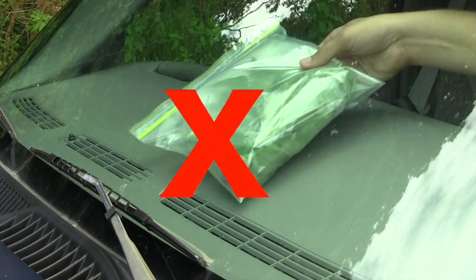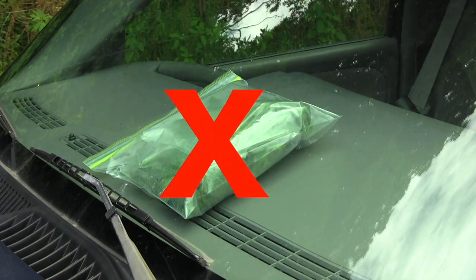Avoid leaving samples on the dashboard of your truck or inside a hot vehicle. The samples break down fairly quickly in hot conditions, and that prevents us from extracting the genetic material we need from the plant.